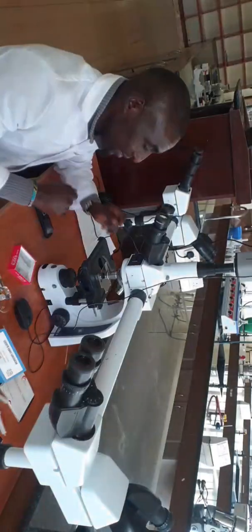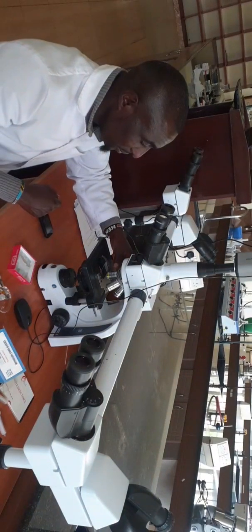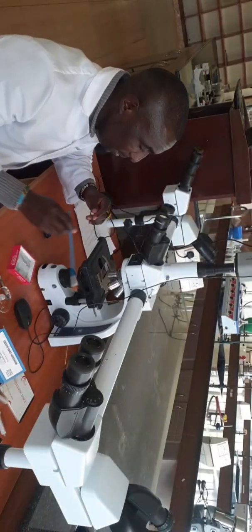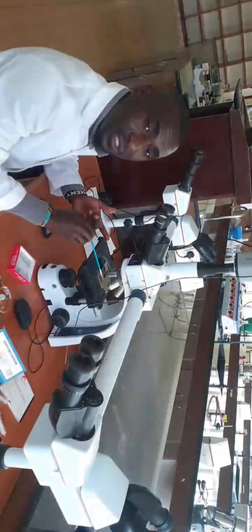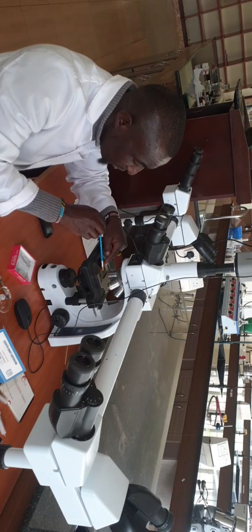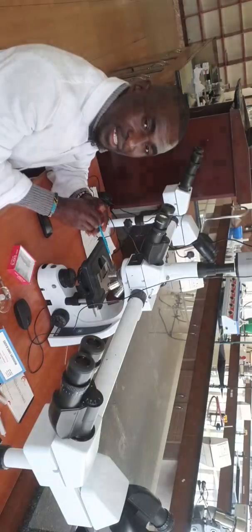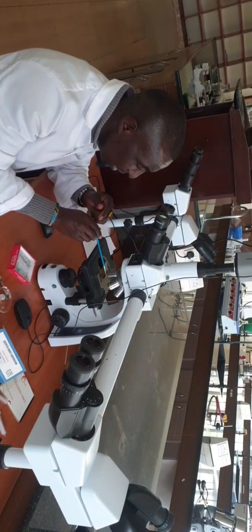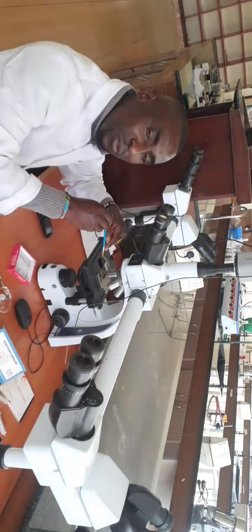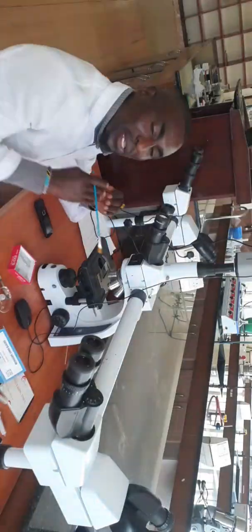So that is the revolving nose piece. Remember also that when you're using the revolving nose piece, the distance changes. This is what's called the working distance: the distance between the object on the stage and the lenses of the objective. This distance up to here is a bit wider, so the specimen will be smaller. The smaller the specimen, the wider the working distance. But the bigger the specimen, the smaller the working distance.